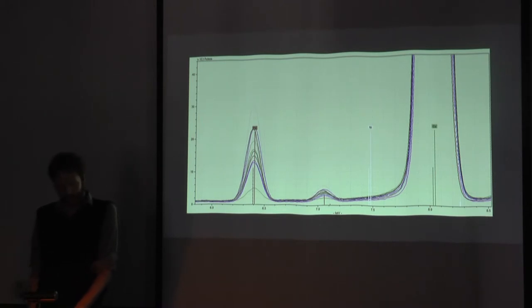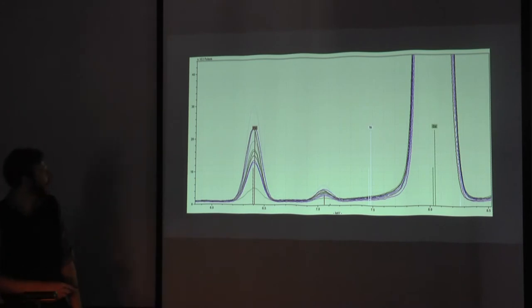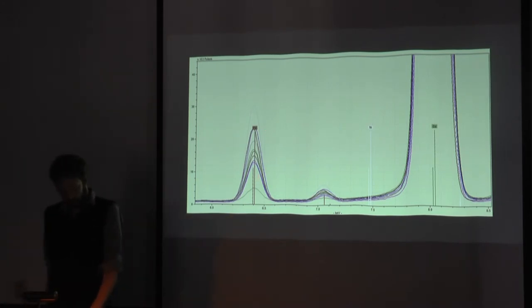But the helmet actually had a relatively diverse range of chemical inclusions. The inconsistency of the metal suggests that the helmet was constructed using ancient metalsmithing techniques. Moreover, every spectrum contained some amount of iron, Fe, which you can see with all these little different blips of different sizes. Iron is a naturally occurring element in most European soils, and it tends to bleed into archaeological artifacts that have been sitting in the earth for an extended period of time.